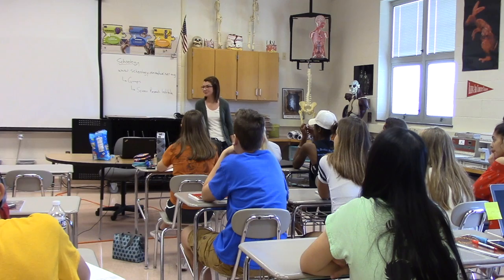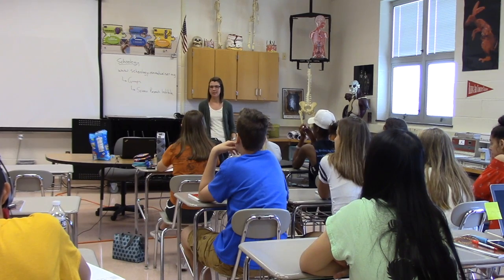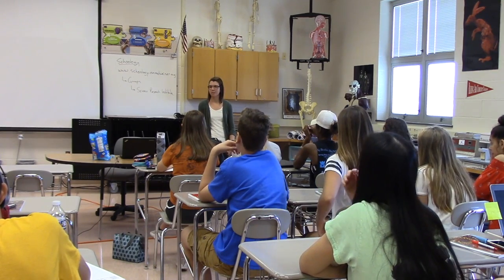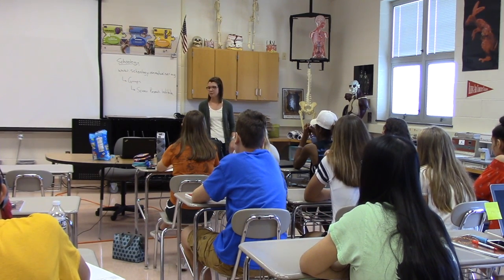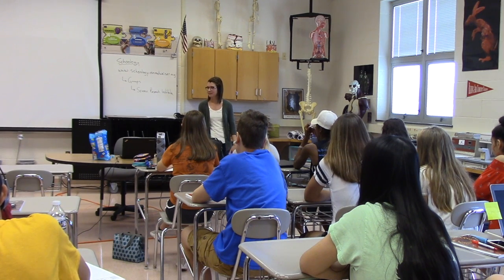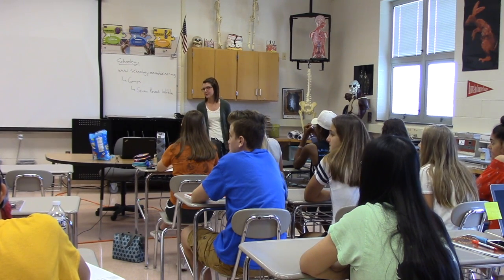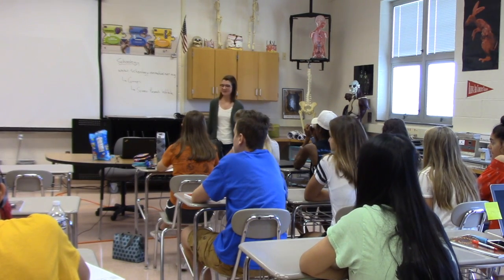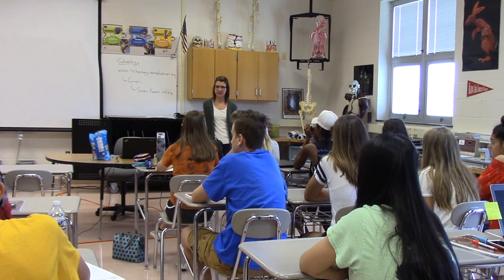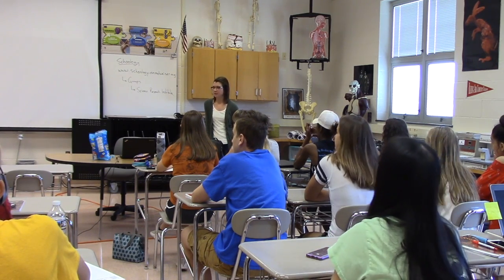I've quickly learned how to do most of everything. I don't do a ton of PCR. My group is more cell-based. I do mycoplasma detection testing, so I do PCR on that. I do ELISAs, I do cell-based immunoassays, and that's basically what I like most in those two. And then Myco is my big project. I've been on that one since the beginning phase of development, which is pretty cool to see through. But it's now moving into routine.